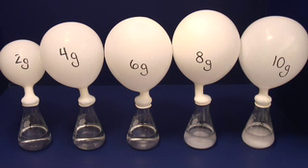Note that flasks 3, 4, and 5 contain unreacted baking soda. Why do you suppose the baking soda has not reacted?